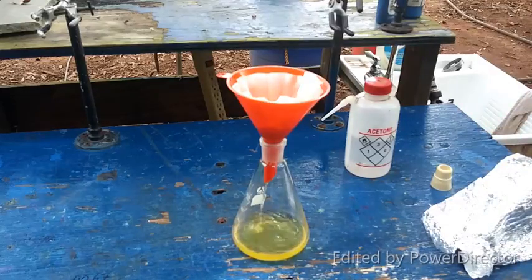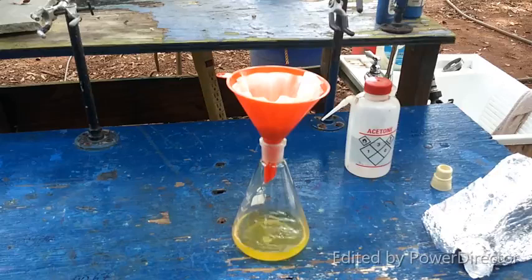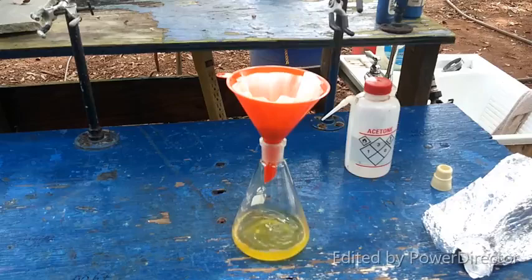Alright, so now what I'm going to do is continue to evaporate off the rest of the acetone, or at least the vast majority of it, and then we are going to clean up this iodine in here, get that out of there, and then we will do the final distillation to get our purified product. So I will come back once I have gotten rid of more of the acetone and I am ready to move on to the next step.